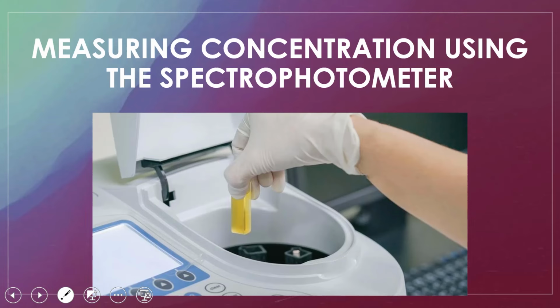In today's class and video, we are going to look at how to measure the concentration of an unknown sample using the spectrophotometer.